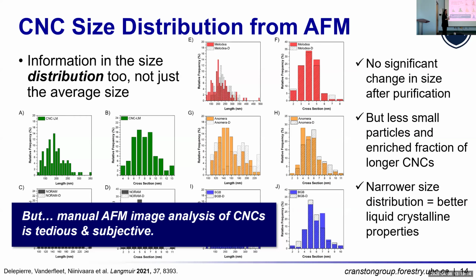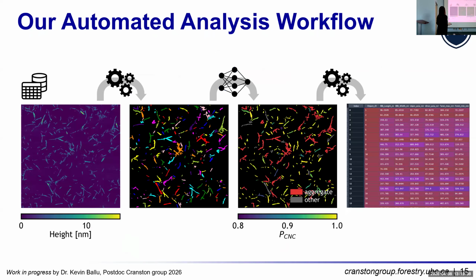And after years of doing this, we have all decided that this is a bit tedious and subjective. So I wanted to tell you a tiny bit of something that we're working on now to stop measuring particles by hand. And I can say that I have worked on standards development with Canadian Standards Association and ISO. And so measuring 150 particles by hand is the standard, but I think we can do better.